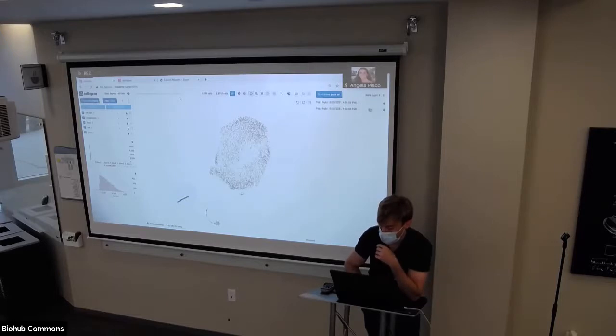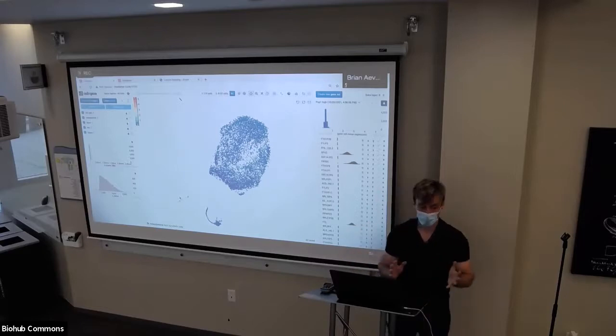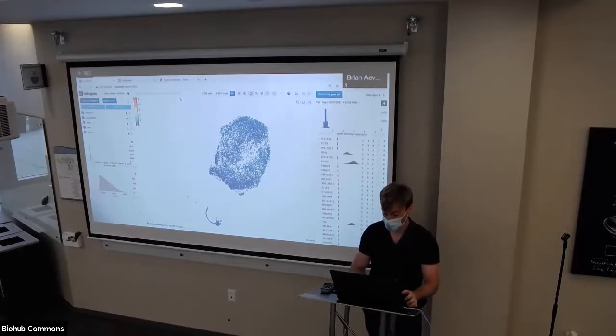And then 2 things pop out. Let's expand this. First, let's color by the average, and we see, oh, cool. First of all, the top 10 genes seem to, on average, be enriched here. That already is a sign to me that this is probably a legit cell type or subtype or state of a cell type. And you can do the same thing for others.